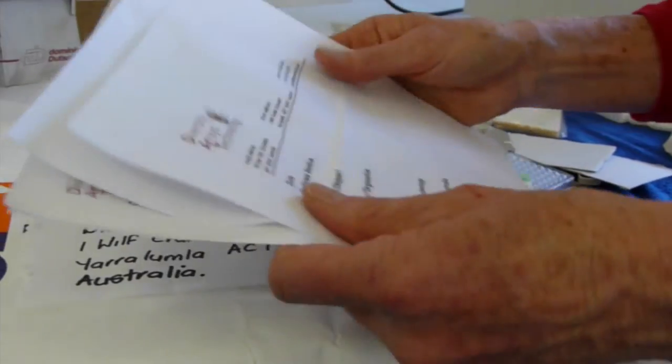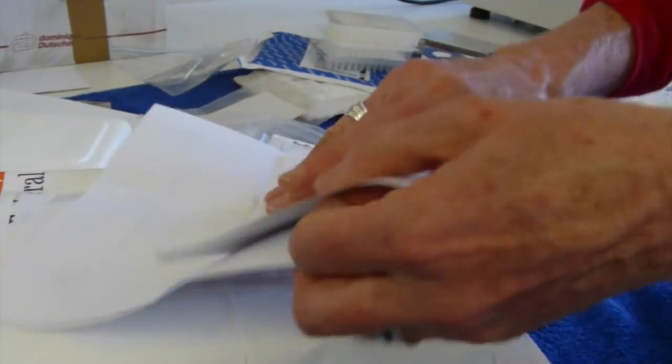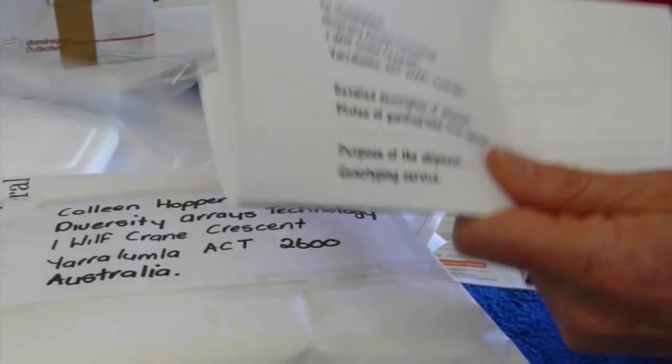Please remember to attach a copy of all three documents to the outside of your package. This prevents the parcel from being caught up in customs.